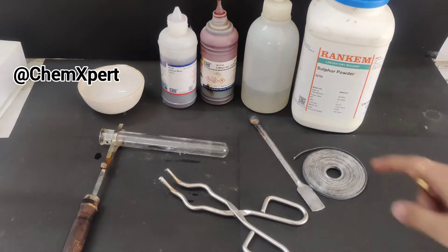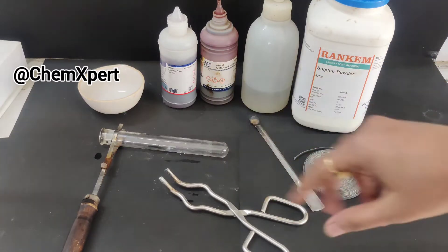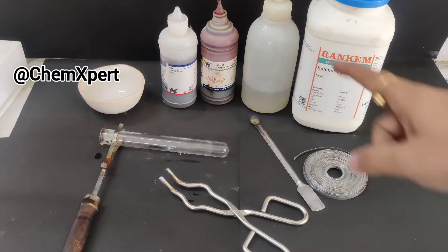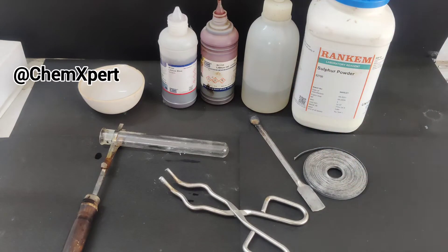In this activity we will burn both samples and collect their ash in separate test tubes, then dissolve that ash and add blue or red litmus to observe the change. So let's perform this activity.